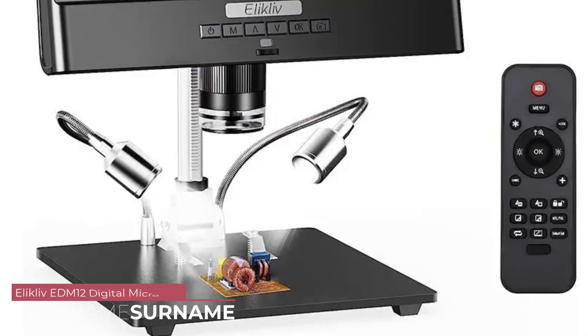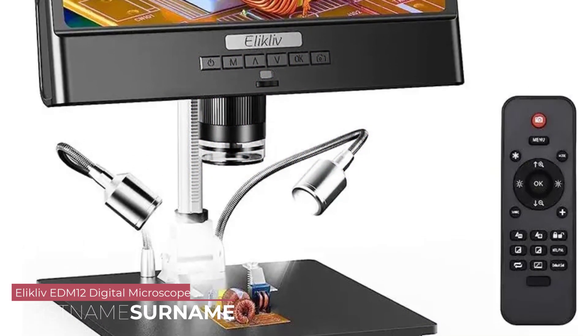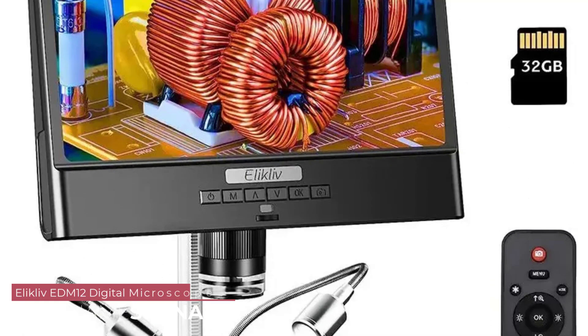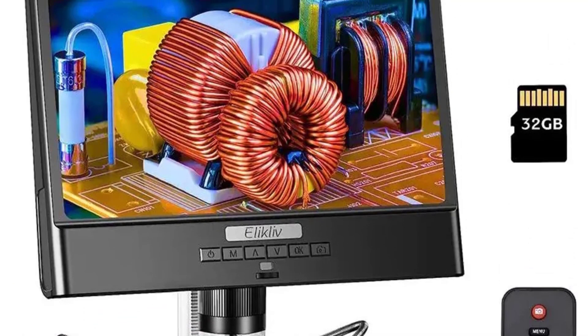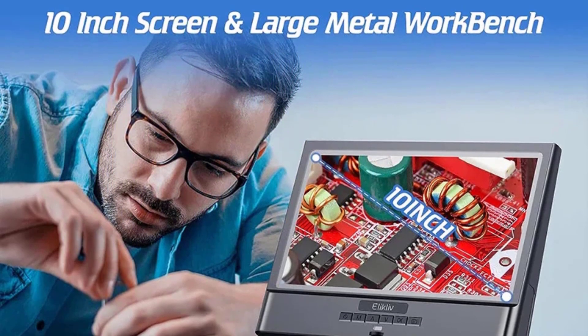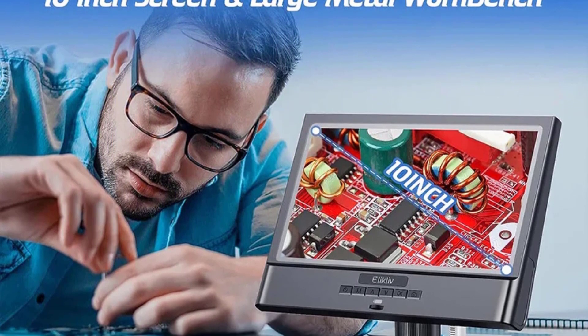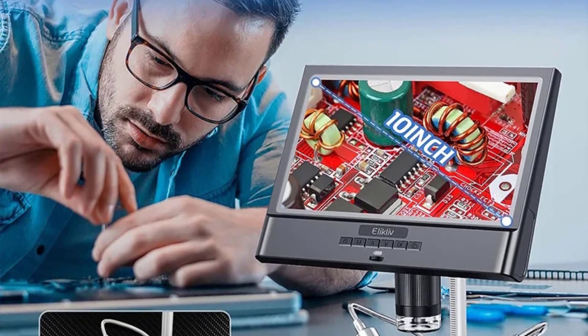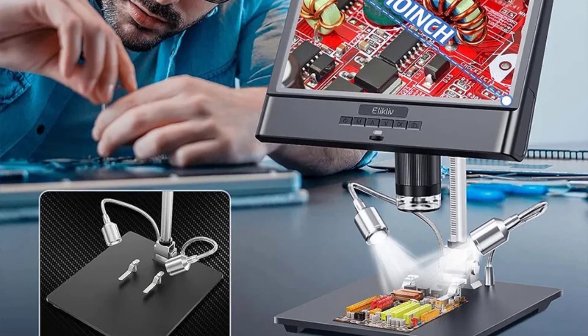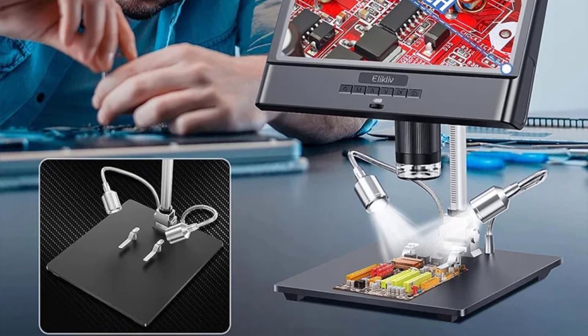Number 5: Elikliv EDM-12 Digital Microscope. The EDM-12 boasts a sturdy construction with an aluminium alloy body that ensures durability and longevity. The monocular draw tube provides a comfortable viewing experience, and the inclusion of an aluminium alloy stand and base adds stability during operation. The sleek design makes it easy to handle and maneuver, contributing to its handheld and portable nature.